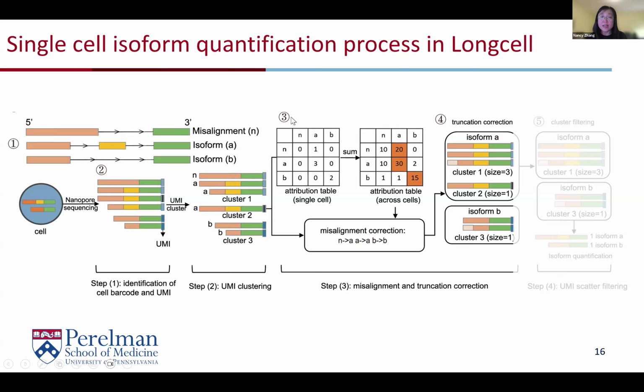Okay, so of course, this intuition of the wrong isoform being lower count than the correct isoform may be violated just due to sampling error, right? Because we say the error probability is low, so that should be the way it is. But sometimes with low counts, you can still have the wrong isoform being the one with the highest count.